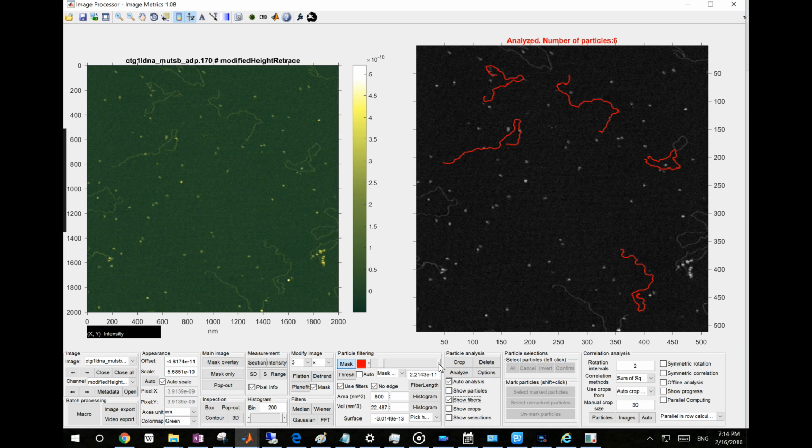Let me see if I go up a little bit. I think it takes some time. I think right now it's working, but it's not showing me anything. Let's go a little bit further. Oh, right now. So it takes some time. It's not very responsive. As you see, after some threshold, the particles, yeah, then you can decrease this. There's some kind of erratic behavior. Anyway, hopefully this will work properly in the future.